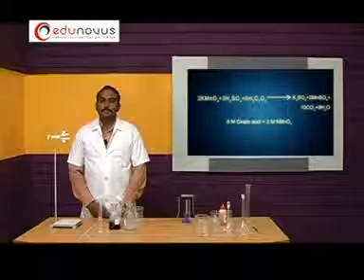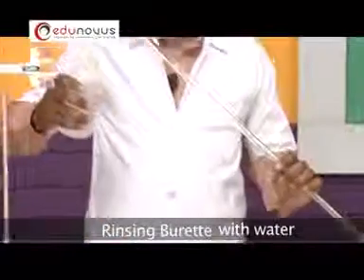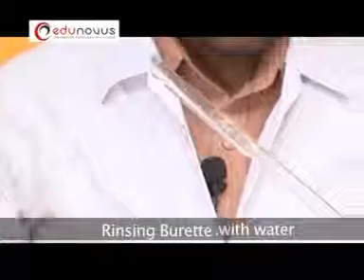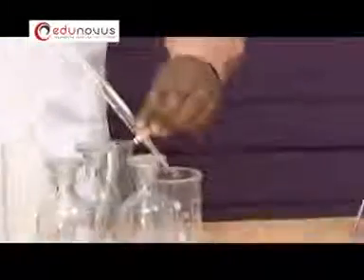Now let's come to the procedure part. Take the burette, rinse it with water, release the water.